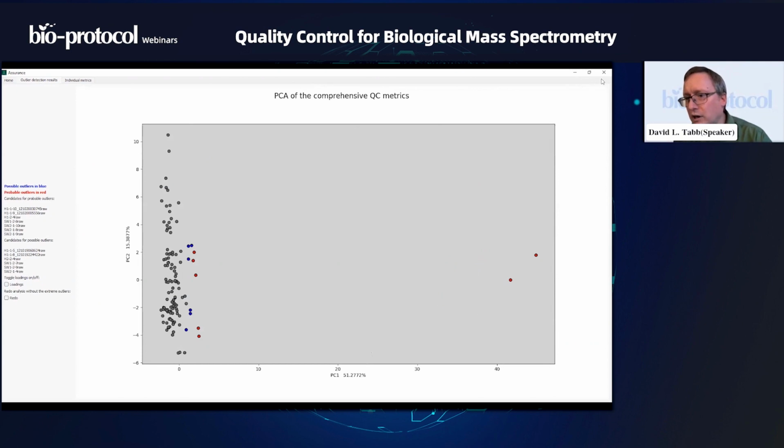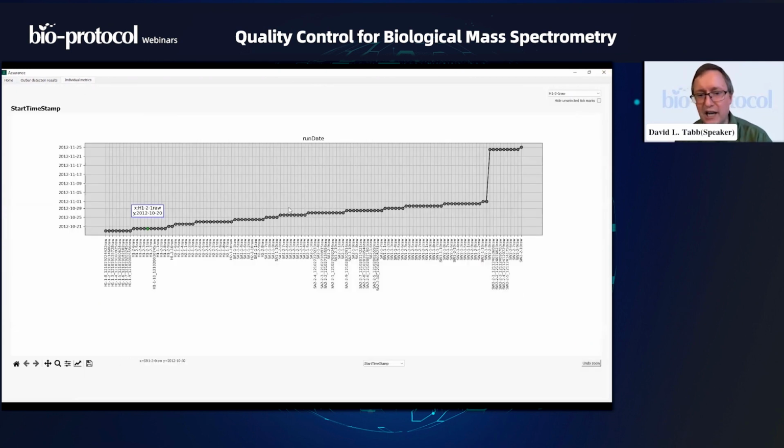The software is called Assurance, and it's available from her GitHub. It's currently in version pre-1.0, and I swear we'll get this manuscript published if I have to write it myself.